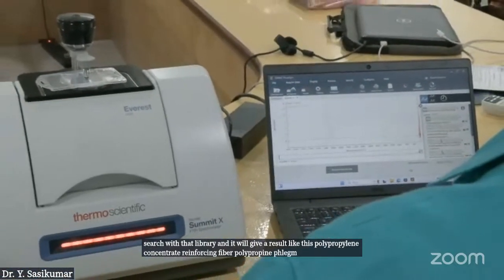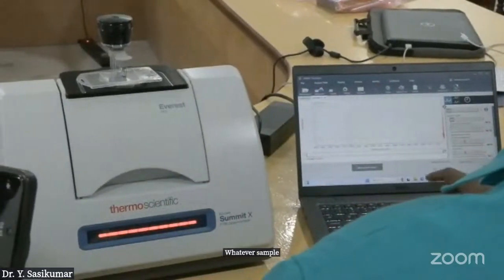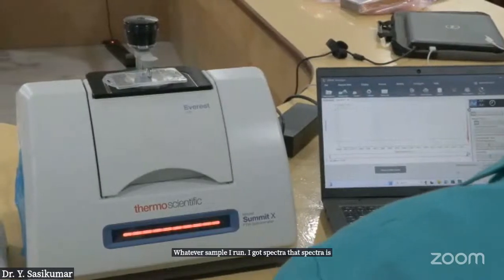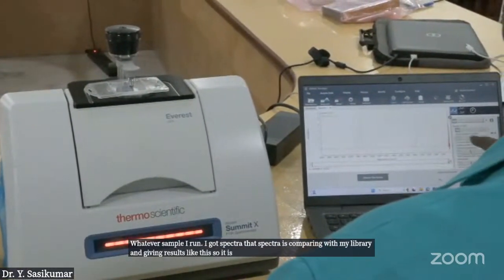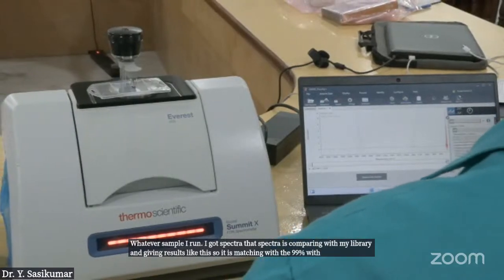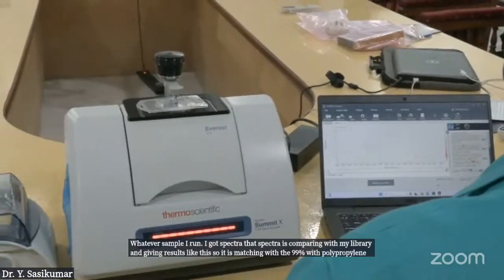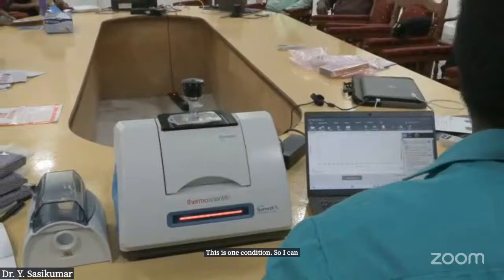The spectrum I ran is compared with my library and gives a result like this. It is matching 99% with polypropylene. This is one condition.